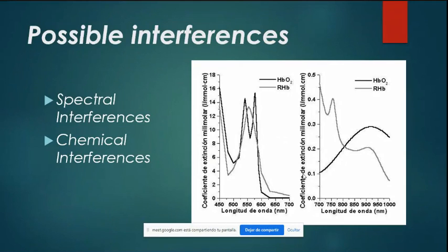These interferences also exist due to combustion products, which have broad absorption bands or are in the form of particles which scatter the radiation. Both of them lead to positive errors by diminishing the light beams.